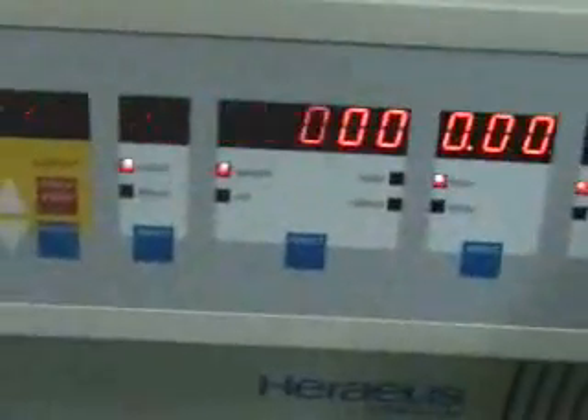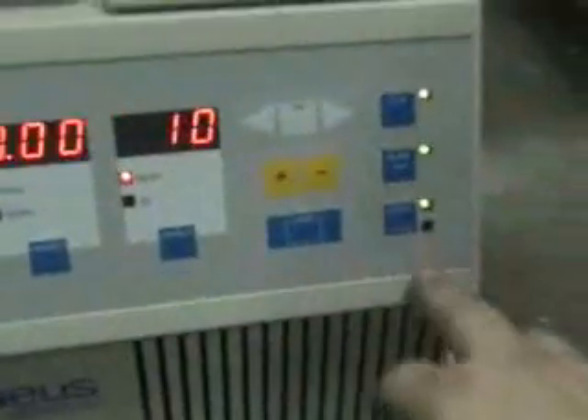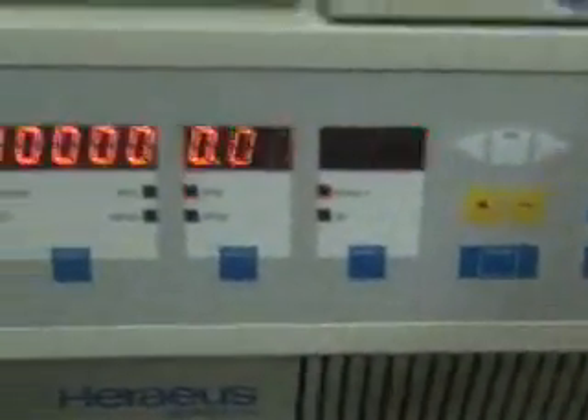Acceleration is how fast to accelerate it. Speed is set to 5000, time set to a minute, temperature set to 5. Go ahead and start it.